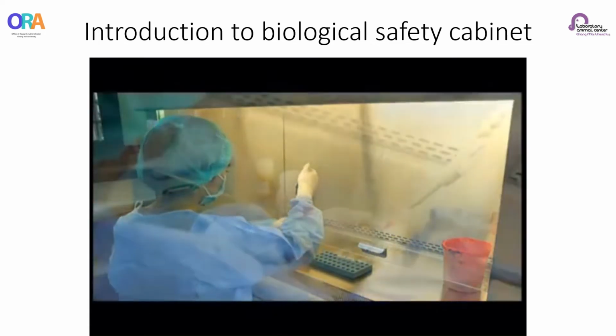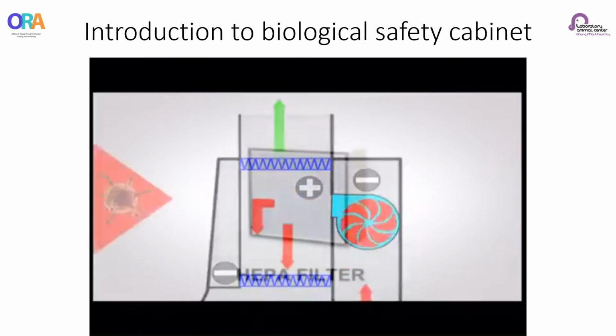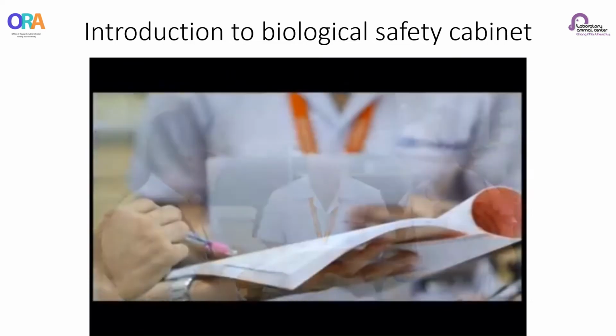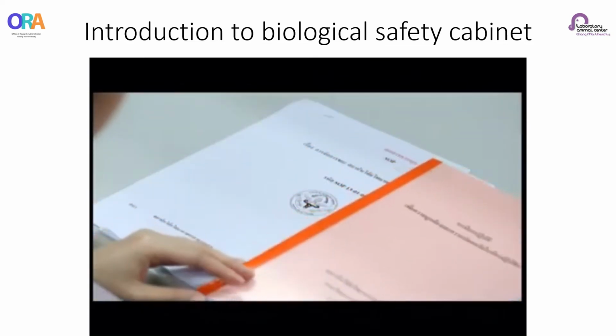In conclusion, the concept of BSC operations revolves around how the blower works and the efficiency of the HEPA filter. The laboratory supervisor and responsible personnel, including the BSC user, should understand the general principles of operation and proper maintenance of the cabinets.